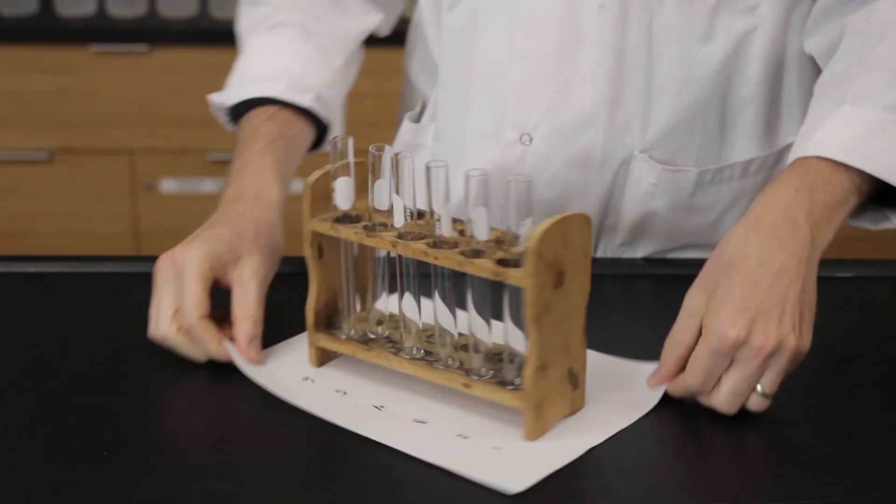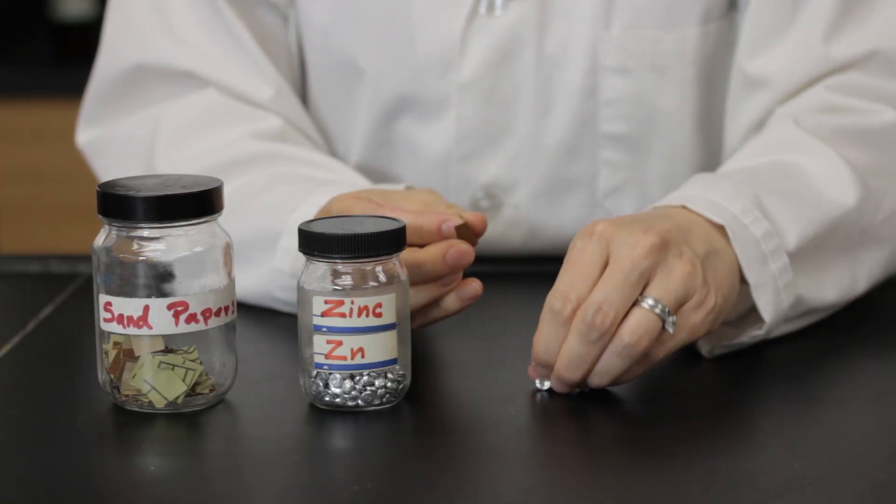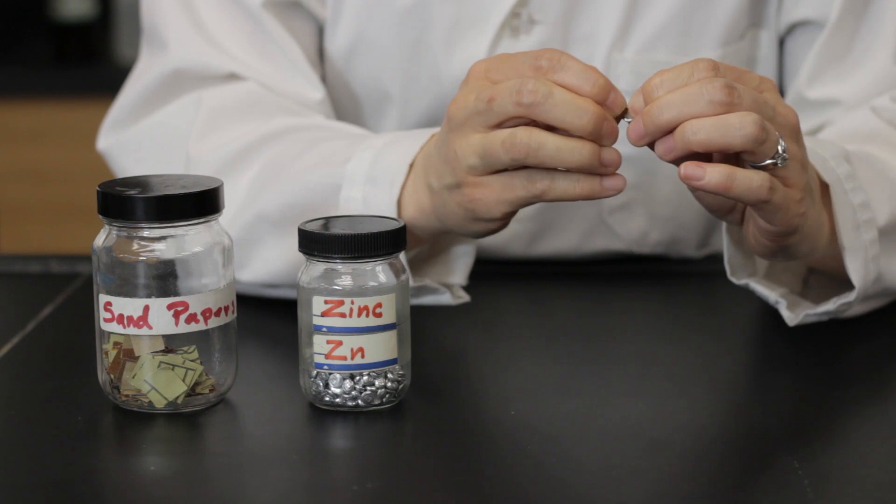Take one test tube at a time from your test tube rack to the reagent bench. Use sandpaper and scrub the metal.